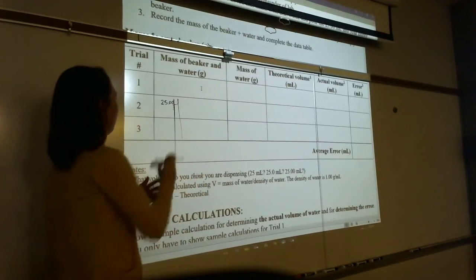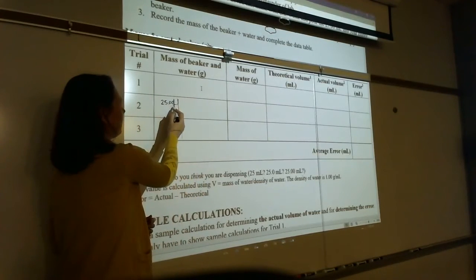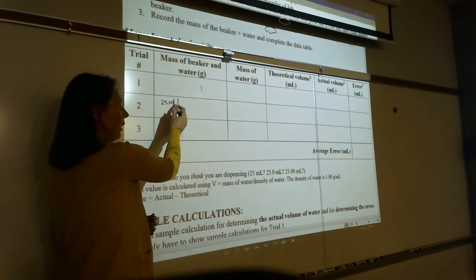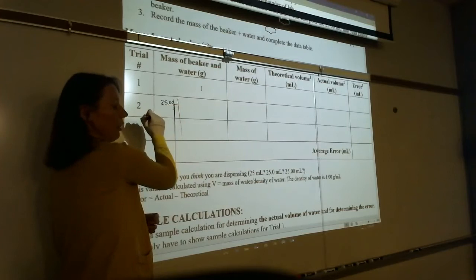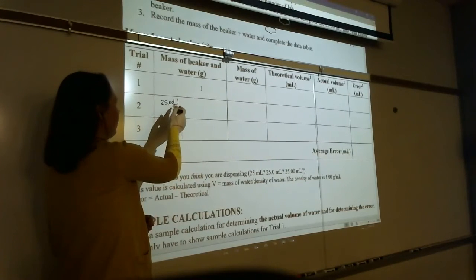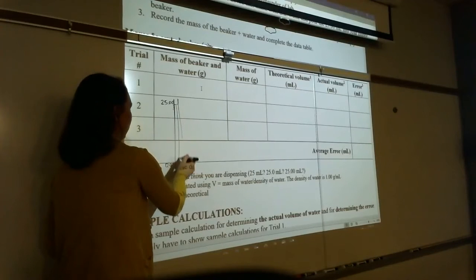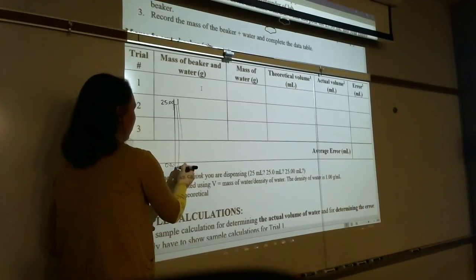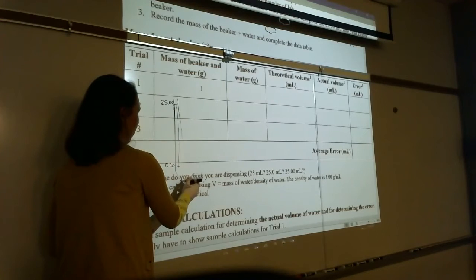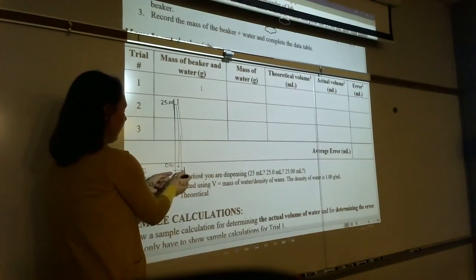And then you have the value that you're confident in, because these are all 0.1s. It's going to be 25, if it's directly on that mark, 25.00, right? And to dispense 25.00, all the way, you would let it drain all the way down to 0.00. And then it kind of comes to a point here at the end, and then this is where you control it.